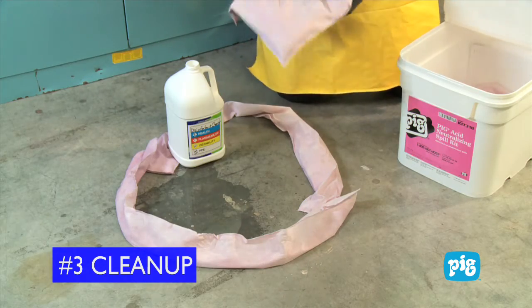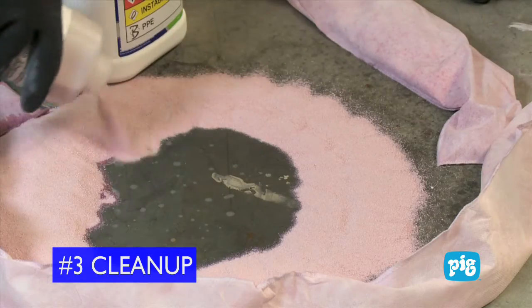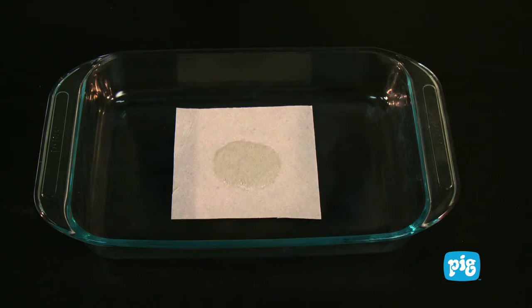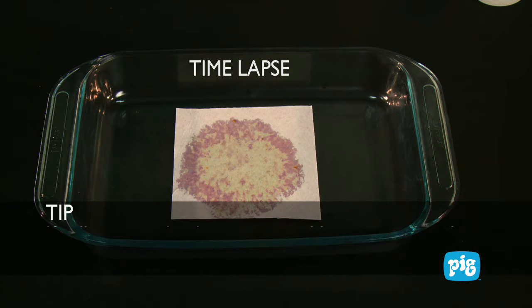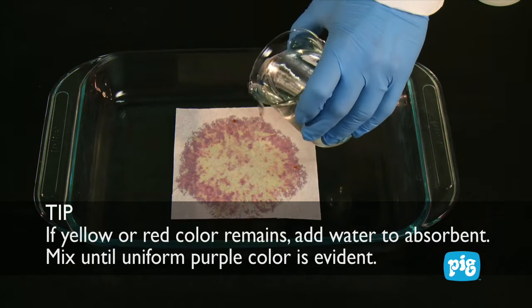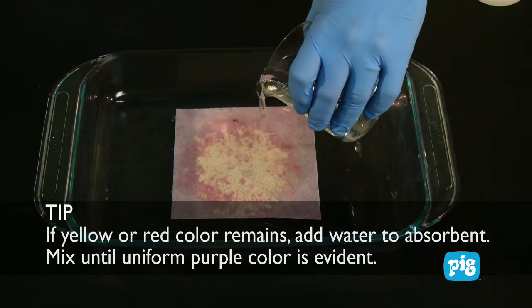For larger volume spills, use absorbent pillows or loose absorbent to absorb the spilled liquid. The kit contains color-changing absorbents that change colors to indicate the level of acidity of the liquid spilled. Once the liquid is neutralized, the absorbents revert back to their original color. Yet another tip: if a yellow or red color remains, carefully add small quantities of water to the absorbent. Mix thoroughly until the uniform purple color is evident.